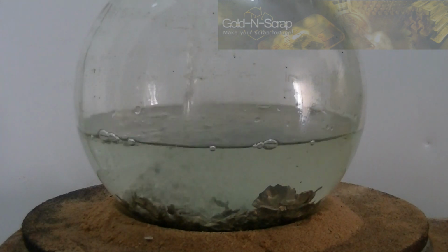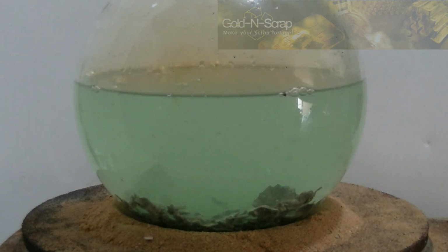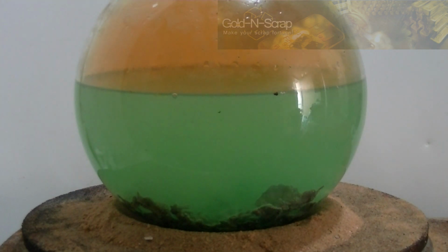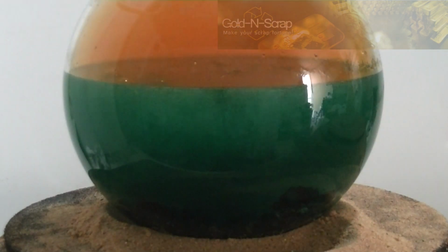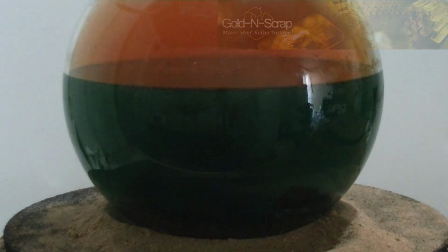The metal granules are placed in a reaction vessel and placed on a hot plate. Here, you can see the addition of the 50-50 nitric acid solution. That means half of the solution is 70% nitric and the other half is distilled water. The nitric leach usually takes about 2 to 3 hours at near boiling temperature. The acid will dissolve all of the silver and other base metals such as copper, nickel, and zinc into the solution.